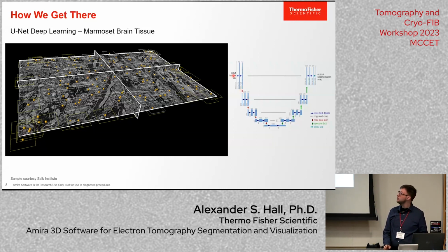So we have an input image on the left, and then it goes through several convolutional layers. And then there's, how to call it, a feedback mechanism where we're targeting a certain metric. You can think of it loosely as an accuracy metric, though it's a bit more sophisticated than that.